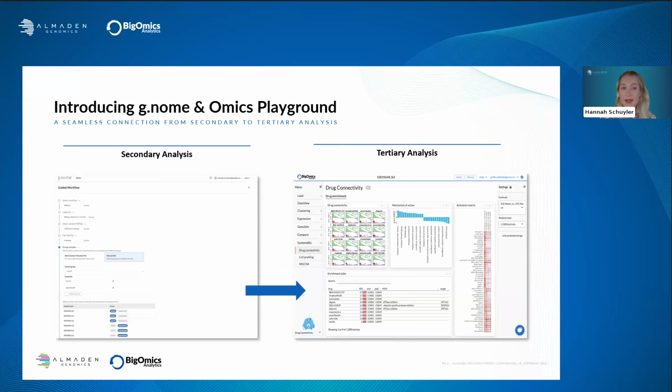So before I pass it over to Kit to walk through the data set, I'd like to poll the audience and get a sense of where you guys are at with RNA-seq data. So in just a second, you should see a poll come up. So when do you anticipate you will be analyzing RNA-seq data? Right now, within the next 3 months, within the next 6 months, within the next year, or I don't need to process any data, I'm here to learn.